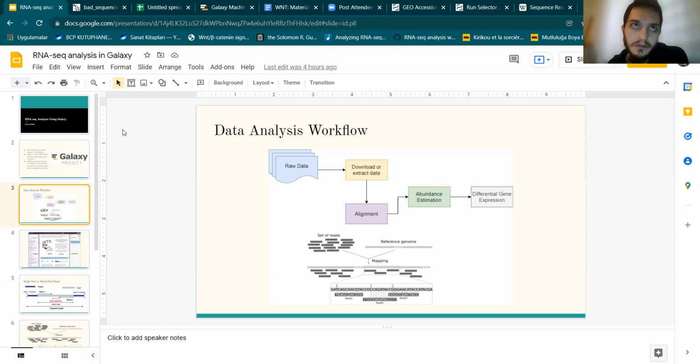It's because the same gene might have different transcripts, you may have alternative splicing, and you may have more than one transcript from the same gene. And then the question is, do we want to count every alternative splicing as a separate thing or as the same thing?